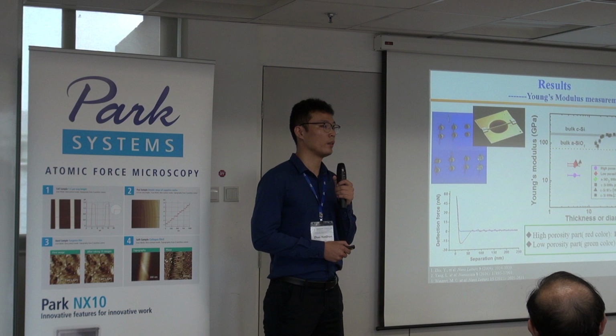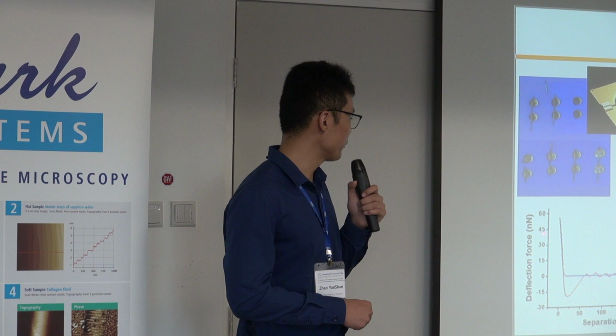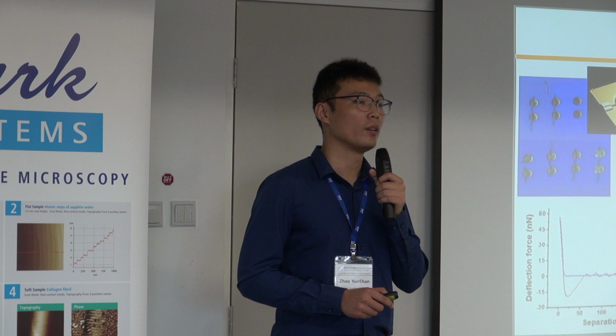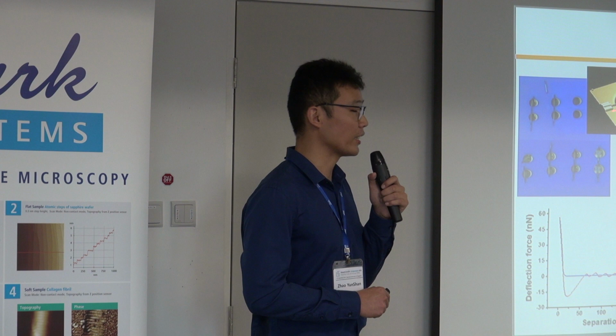What we did is we used the AFM cantilever tip to do the area scan. Yeah, this separation dependent deflection force is coming from the AFM formula. There is a formula to use this curve to extract the Young's modulus. So you apply the load on the wire. We put the force over all the area, but we take the midpoint in the suspended beam for extraction of the Young's modulus.